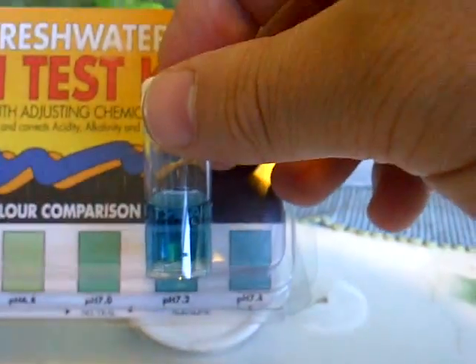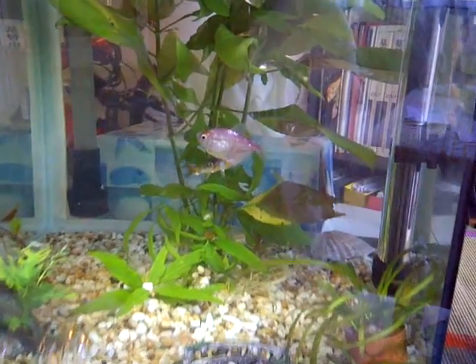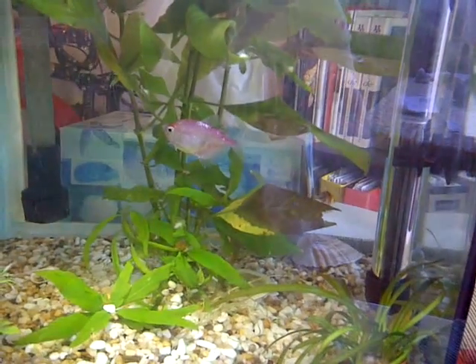And that's how you do a pH test. I think our fish are fairly happy with that, and that's what it does.